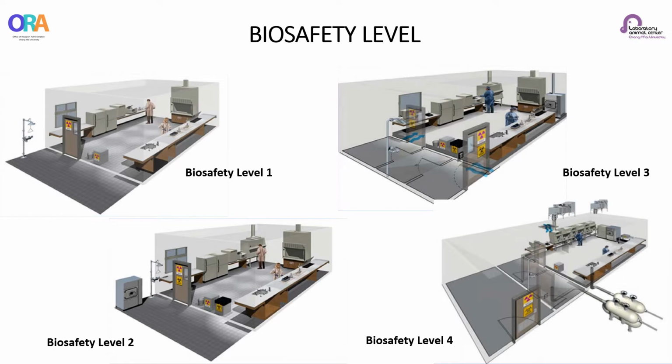And level 4 laboratories are used to study dangerous and exotic biological agents that pose a high individual risk of life-threatening disease that may be transmitted via the aerosol route and for which there is no available vaccine or therapy.